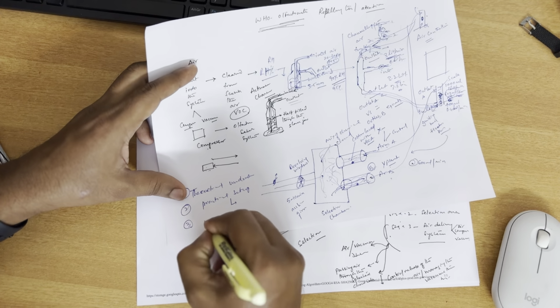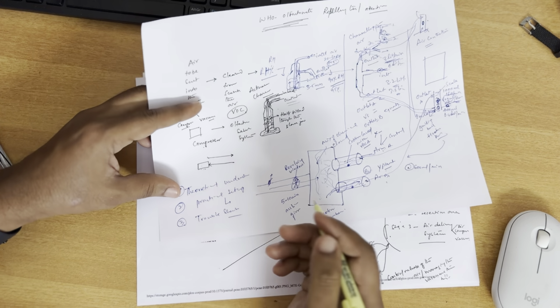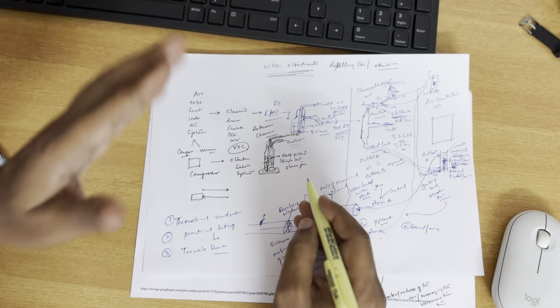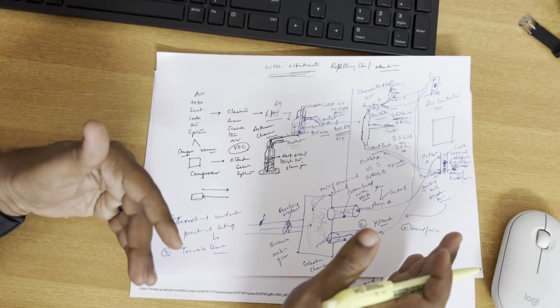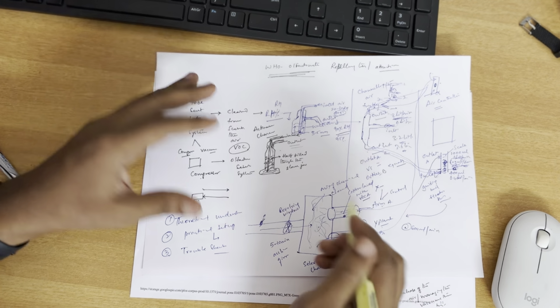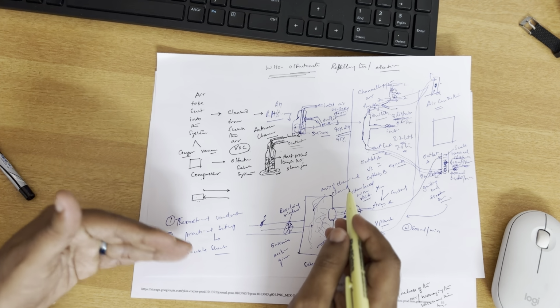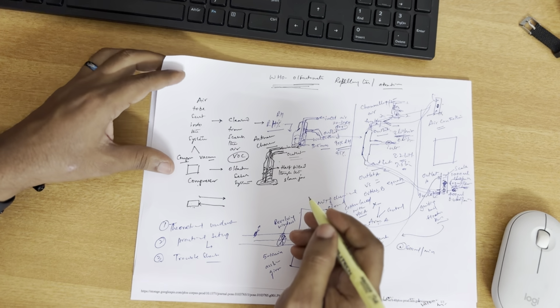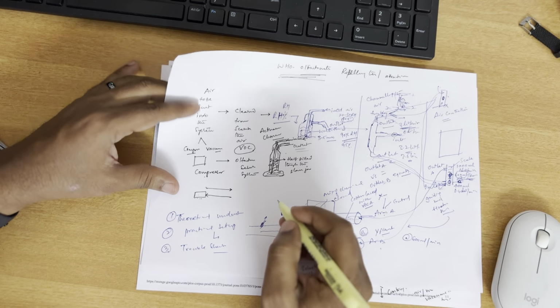And then the third one is troubleshooting. A few times you may have doubts, like when to use the vacuum, when to use the compressor, how to clean it, how to take out the dead insects, what certain difficulties may arise, or how you need to seal the chamber. All those things we will discuss in the troubleshooting section. Okay, this is part 1. Once I have the system ready, we'll make part 2.